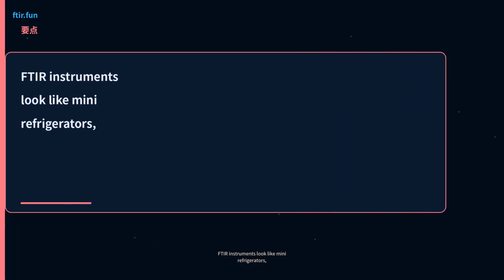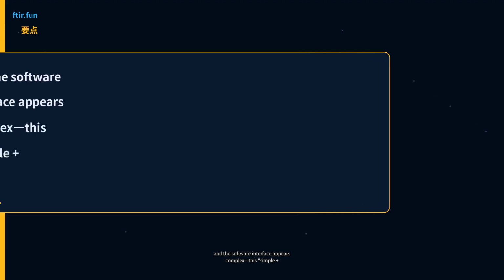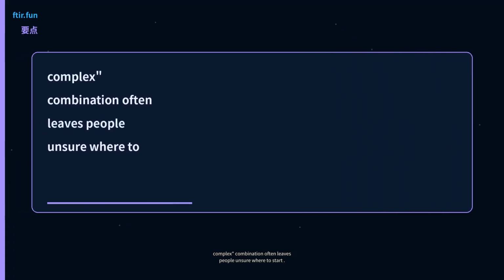FTIR instruments look like mini refrigerators. The control panel is simplified to just a few buttons, and the software interface appears complex. This simple plus complex combination often leaves people unsure where to start.